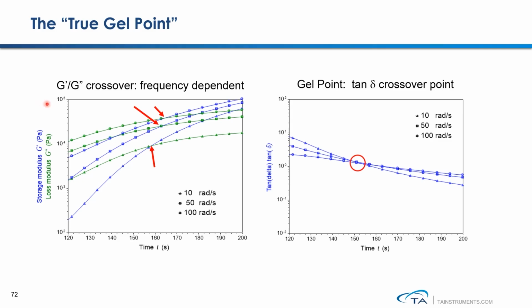This data is showing the thermoset analysis conducted using 3 different frequencies. From these results, you can see that the G crossover occurred at 3 different times. Therefore, Professor Henning Winter recommended a more precise way to describe the true gel point of a cross-linking system. In his method, he recommended conducting the curing analysis using multiple different frequencies.